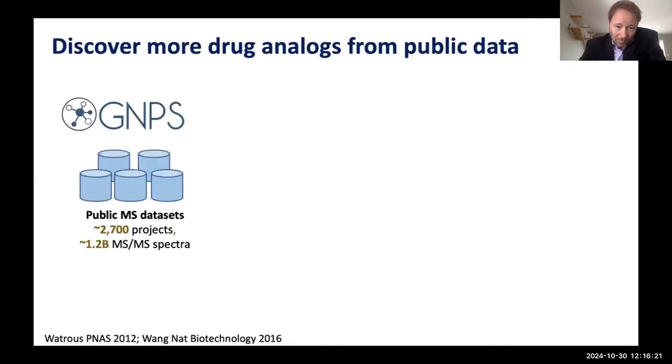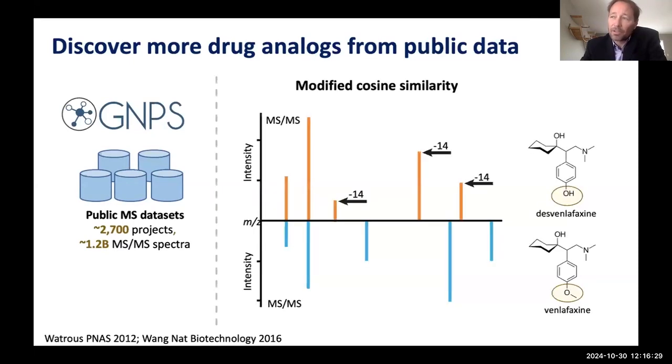And so the way we got to some of the metabolized reference spectra was essentially taking these 105,000 reference spectra, and we did analog searches against the entire public library.